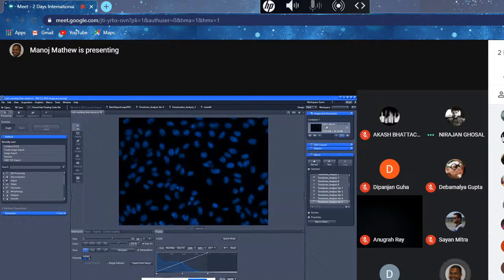It's a university initiative from the University of Dundee, and with this initiative, microscopy formats from different companies can be converted into a standard format called OME-TIFF. So we can, in fact, read formats from other microscopy companies, again subject to the agreements those specific companies have with this Open Microscopy Environment society. But pretty much most of the formats that we have come across, we are able to read in Zen.